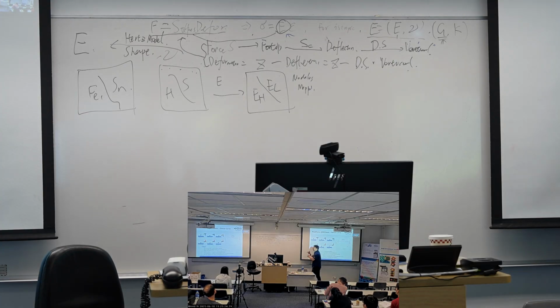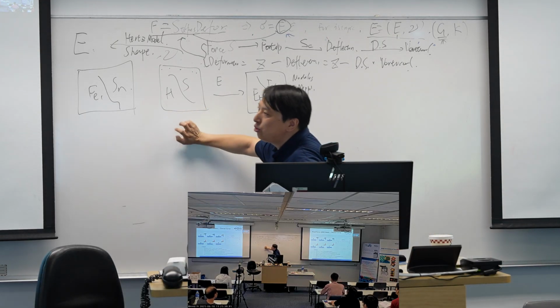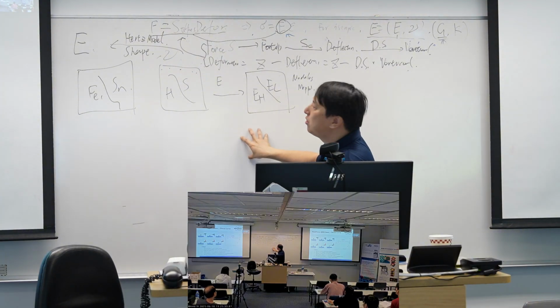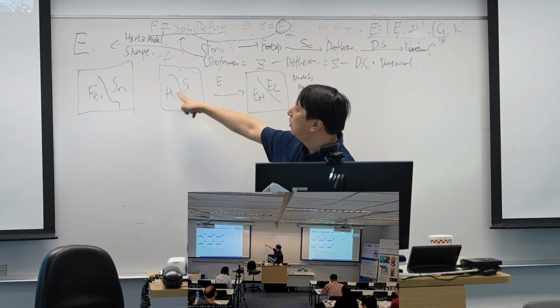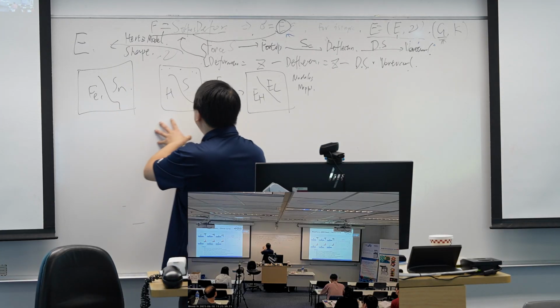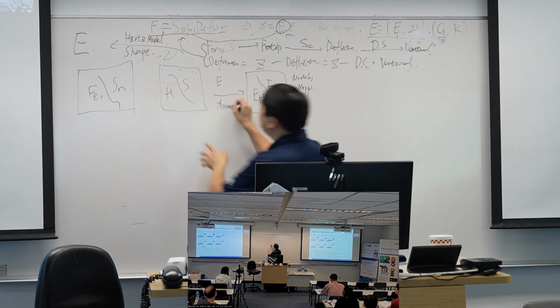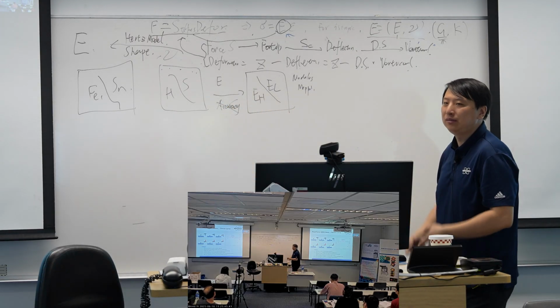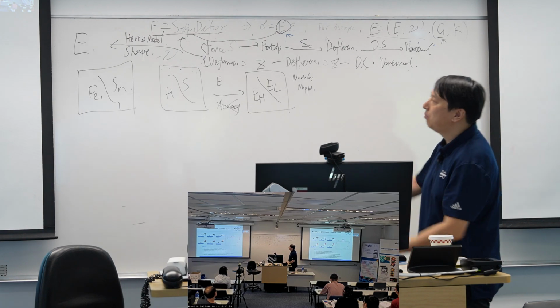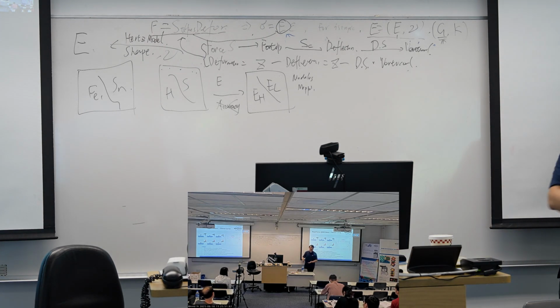Of course, if you just need to get the component mapping, you don't need to know the accurate modulus value of tin or iron. People know the modulus of iron and of tin. They don't need you to tell them.